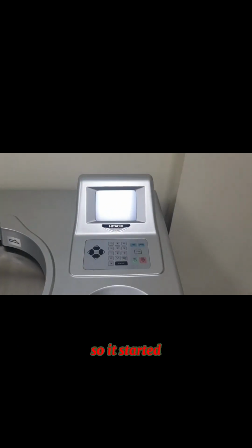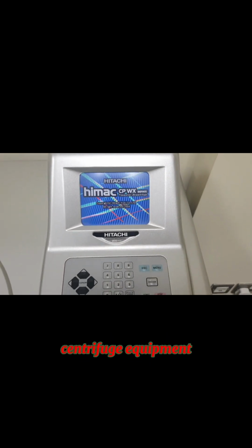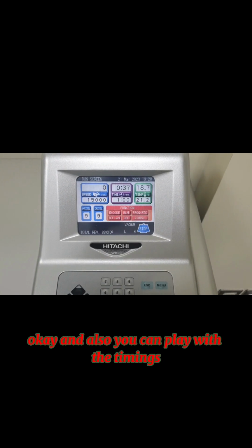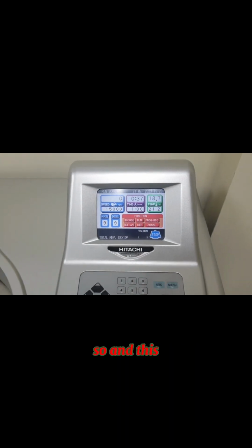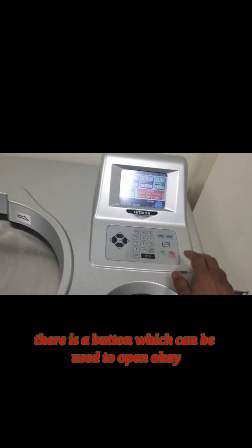You saw it started, and this one is the initialization of the centrifuge equipment. You can see here it can go up to 15,000 rpm. You can also play with the timings, and this is the temperature, and the time also. There is a button which can be used to open.